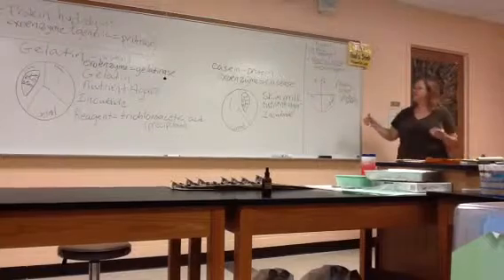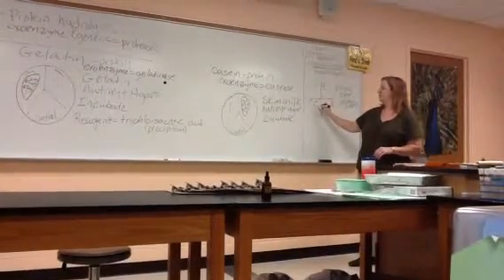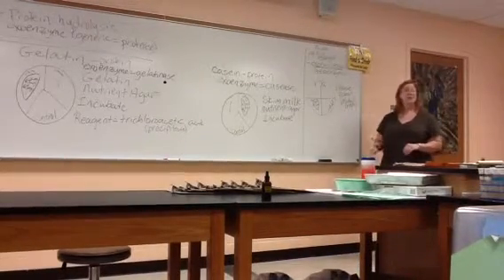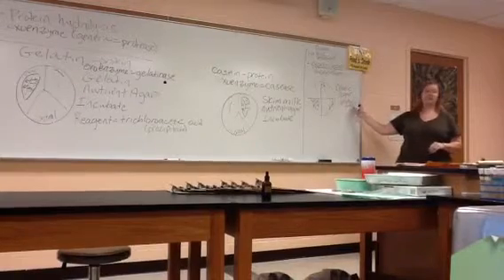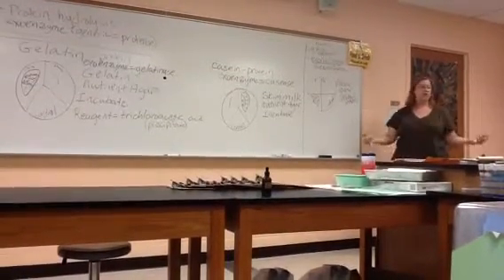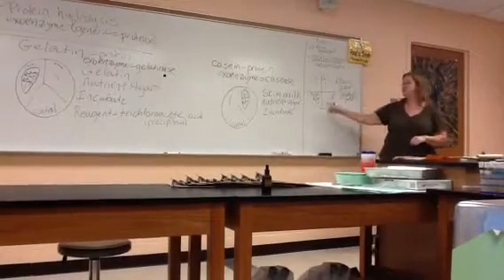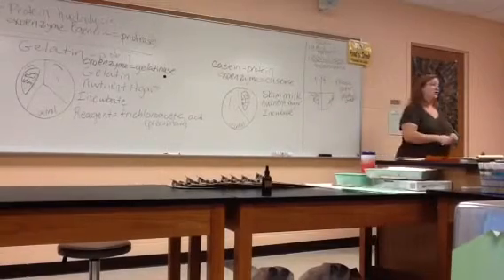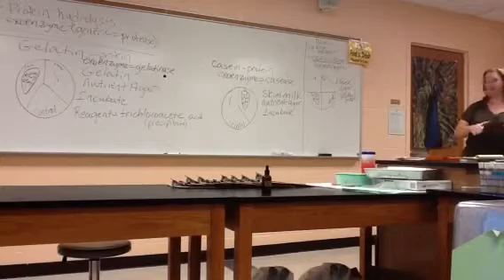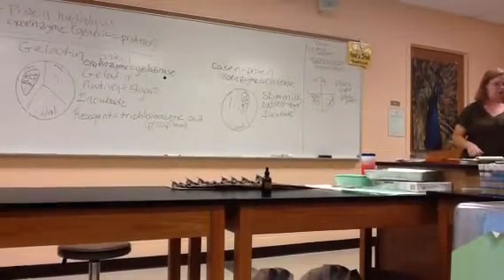Whichever bacteria is positive, let's assume it's three, it's going to produce exonuclease and destroy all of the DNA around it. With this particular test, that also destroys the green color. So when we come back next time, there's no need to add a reagent because it's already green. Positive result, there'll be no green color around the bacterial growth. The bacteria will have released exonuclease and destroyed it all. So no green color around the bacterial growth.